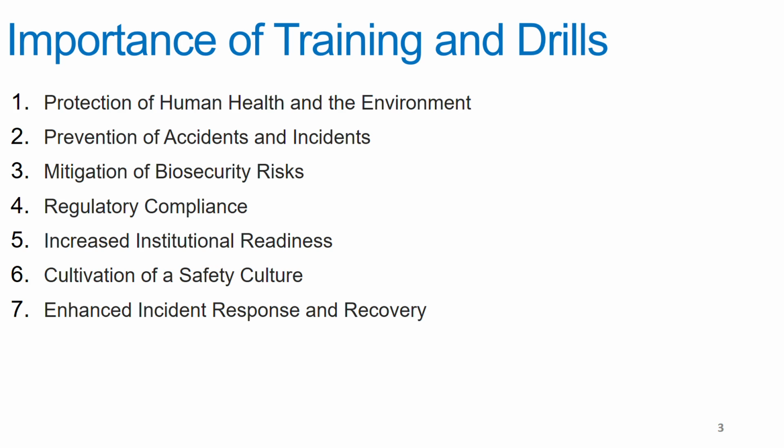Then prevention of accidents and incidents. If you're conducting proper training, you're going to reduce the number of incidents and accidents because people will be aware of their surroundings. And if you're conducting regular drills, people will know how to respond just in case there's an incident or an accident in the laboratory.